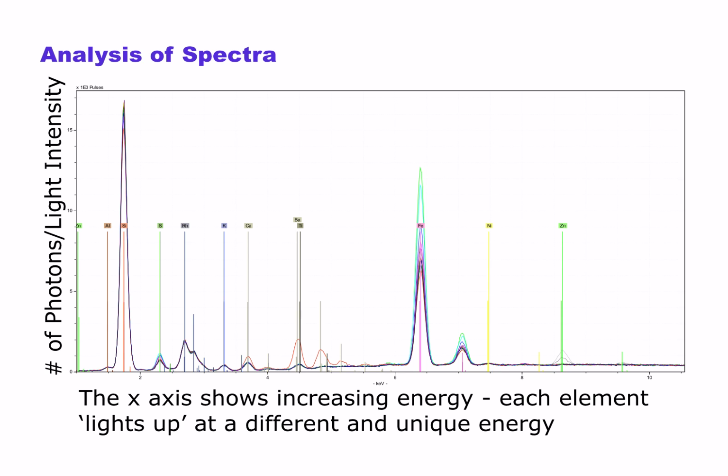And then, as you can tell from the high concentration of silica to the far left, this is a silicate sample. Now, what's important to remember: if this is a silicate sample, do you know what element is the most common? This is going to be true for ceramics, obsidian, glass, and dirt, and all the rocks you see. You might say the most common element is silicon, but it's not. It's actually oxygen. About half the weight of that rock, if you hold it in your hand, is going to be coming from oxygen. In fact, you can think of all the other elements present, whether it's silicon, aluminum, sulfur, iron, calcium, as just being glue that's holding together a lot of oxygen.